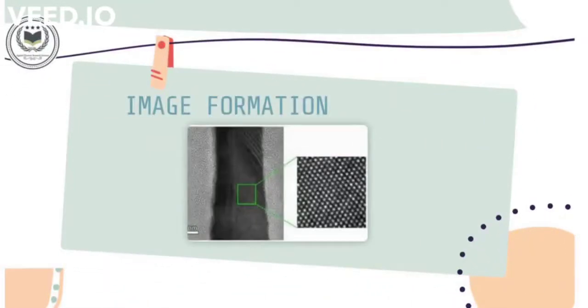TEM can magnify any material to this much. In this image, a small fiber was viewed under TEM. See how magnified an image can be available using TEM.